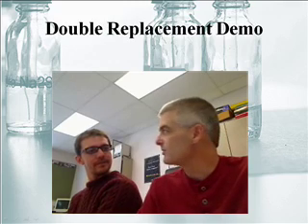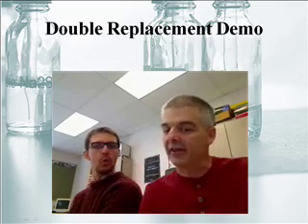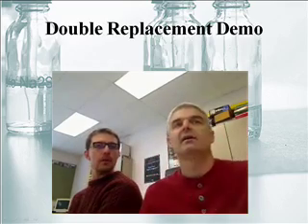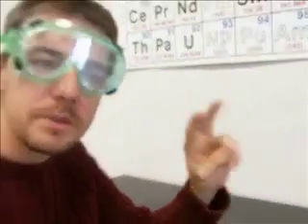All right, so I think we should do a demonstration. Mr. Sams, you ready? I'm ready. Mix some chemicals and put them together into something very interesting. Now we want to show you a double replacement reaction. A double replacement reaction occurs between two ionic compounds that are in solution.